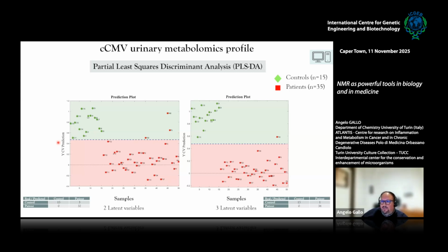These results, obviously, are a bit impressive, strange in this case, but I have to mention that most of these infants were collected between 2-3 weeks after the birth. So the feeding is much more controlled, less variable than adults. So in this case, it was a bit easier.